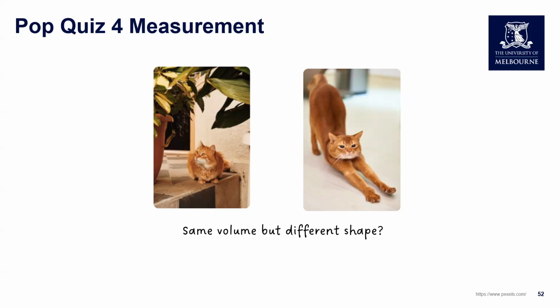And obviously, yes, I've shown you that images taken at low resolution will inherently have high colocalization regardless. So if you're planning to do it, try to take images at as high a resolution as possible. I think most people selected the right answer. So I'm just going to stop sharing.